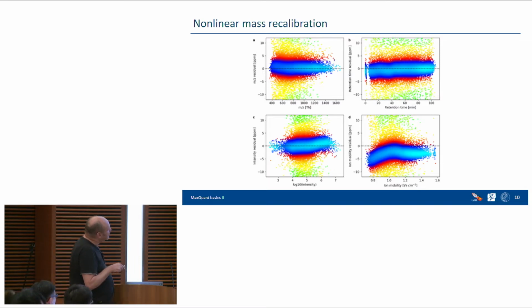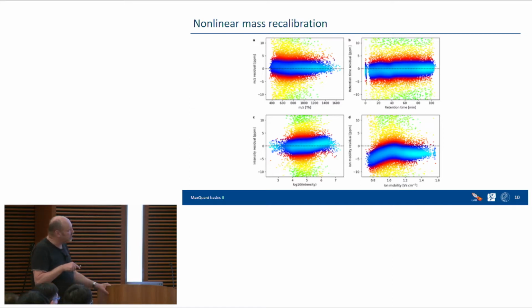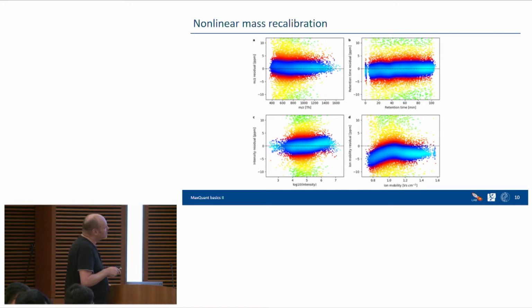And also the other thing, the intensity dependence. That's not something that we introduced because of ion mobility. This is something that we introduced because of TOF. That's the big difference between TOF and Orbitrap: in TOF instruments you actually have an intensity-dependent mass error, while in Orbitrap instruments, miraculously, or by design or whatever, you don't have an intensity-dependent mass error, right? So for regular TOFs, one would have already included this contribution.